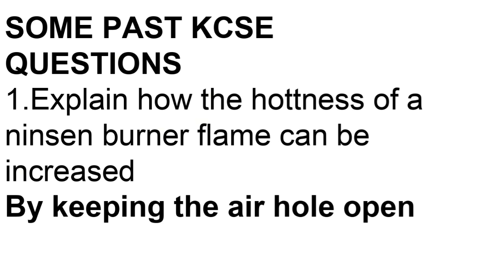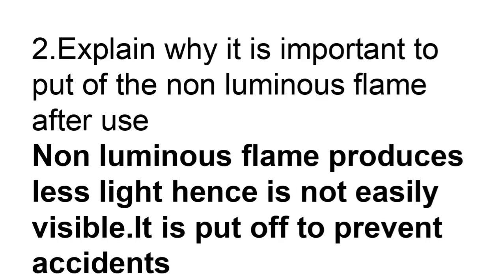Therefore, the answer here is by keeping the air hole open. You can increase the hotness of a Bunsen burner by keeping the air hole open, because that's when you produce the hottest flame, which is the non-luminous flame.